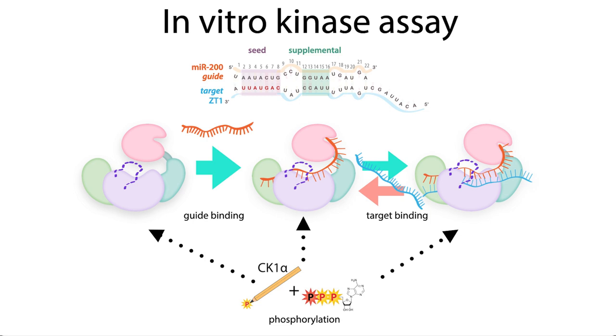If you want to study a biochemical system in mechanistic detail, so actually really dissect what's going on, you need to be able to control the conditions. You need to be working in vitro.